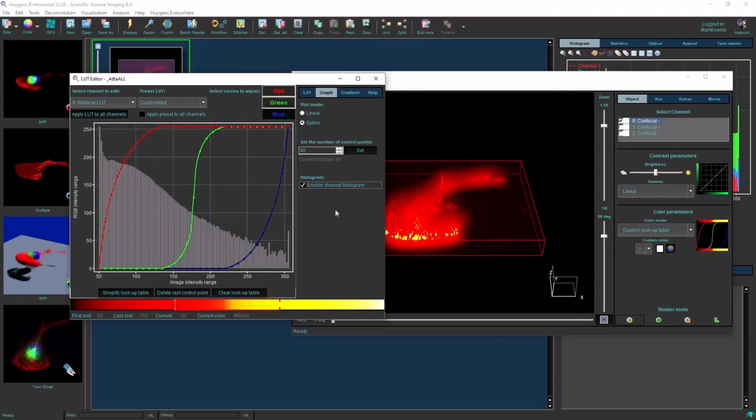This was the Huygens webinar on the lookup table editor. I hope this helps you get started in this new tool.